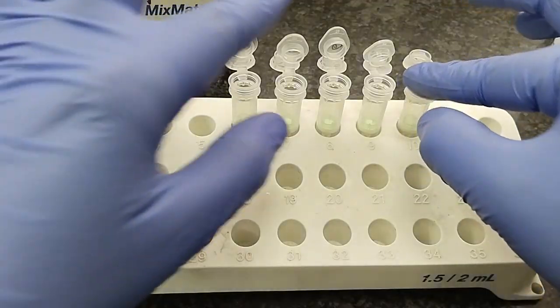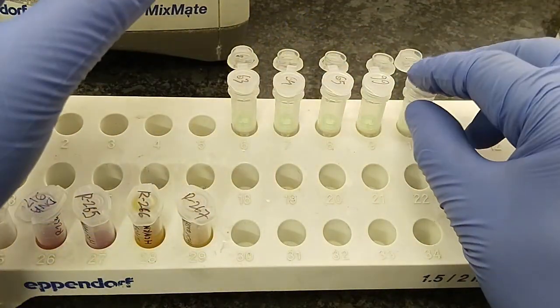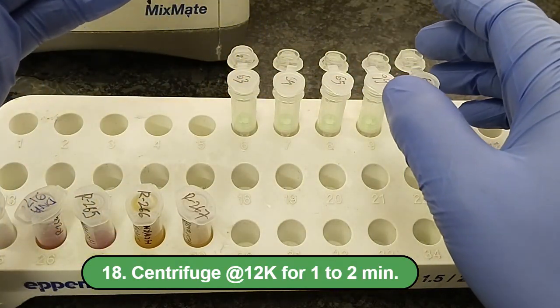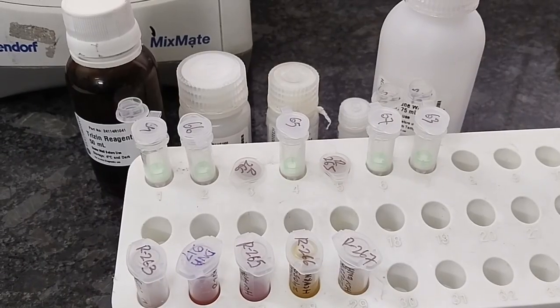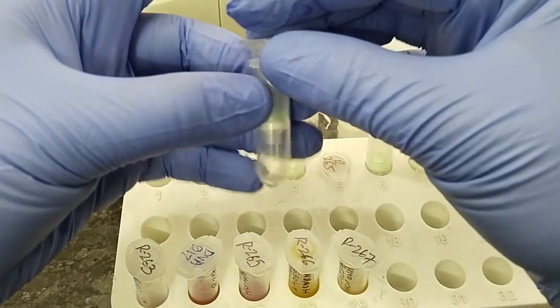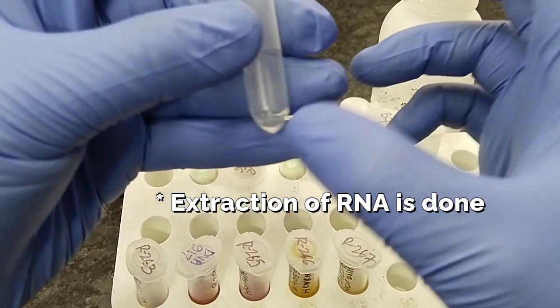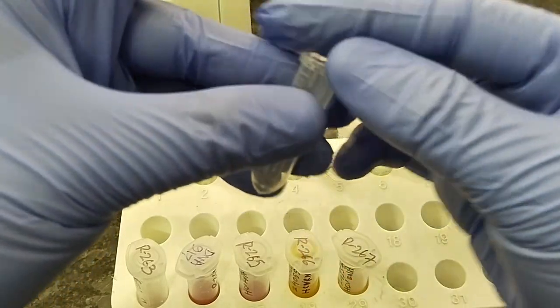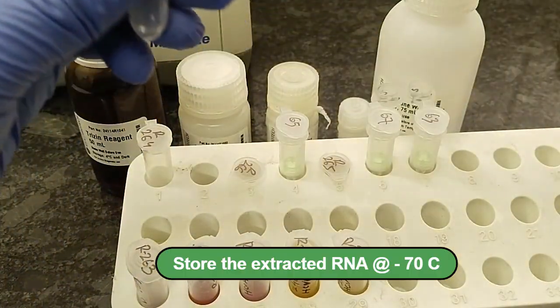Now close the lid and centrifuge the column at 12,000 rpm for 1 minute. Last step, the elution procedure is completed. So now we have to discard the column. Here you can see that the eluted buffer is collected in the collection tube.